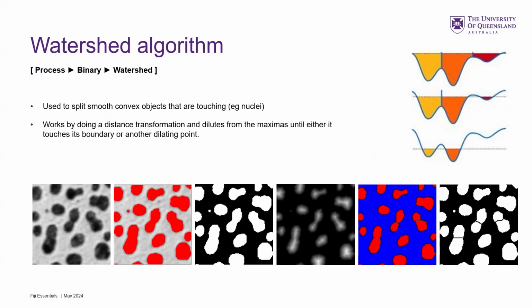Now, there are AI tools, machine learning and deep learning tools now to find nuclei. That's really, really good. But you can still use watershedding to cut stuff. It doesn't tend to work very well if it's like an immune cell where it's all funky, because it's going to chop it up into like 100 different blobs, and then that's kind of useless. So be careful and make sure if you do run a watershed to look at the output and see if it makes sense. But there aren't any parameters you can play with for that watershed.